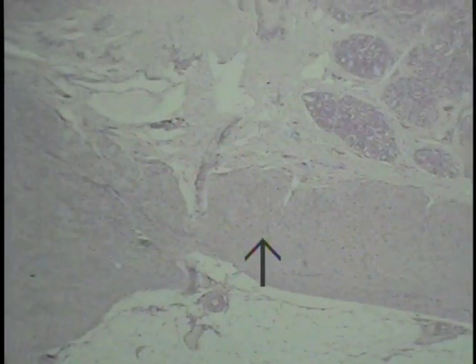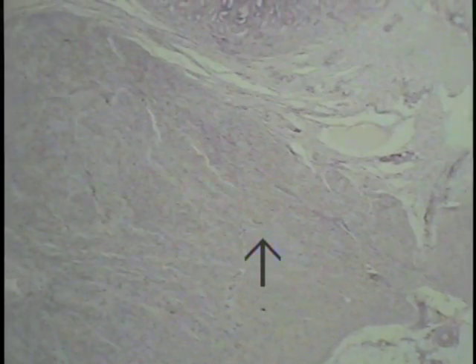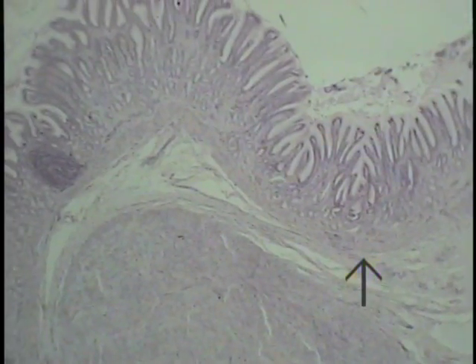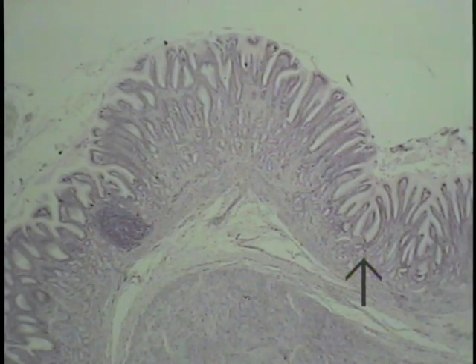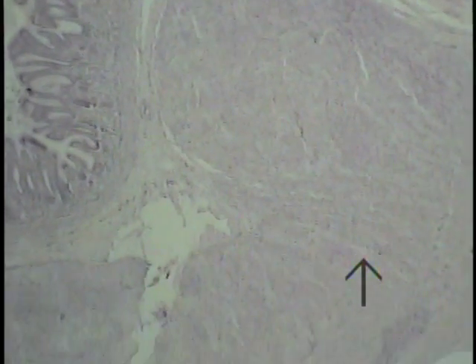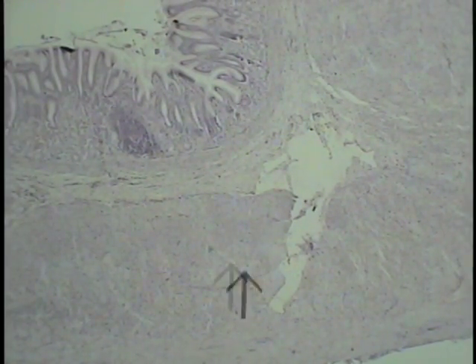of the muscularis externa, one can see how it bulges out and forms a sort of a wad or a spiraling nature of tissue here. This is the pyloric sphincter. Usually it's more closely aligned with the epithelial type junction. That is where the gastric lining epithelium changes to intestinal epithelium. For some reason it is retracted up here just a little bit, but it's nonetheless very interesting to see.